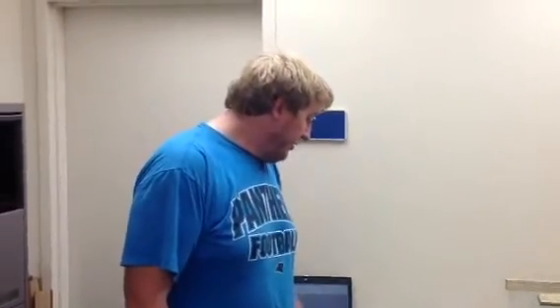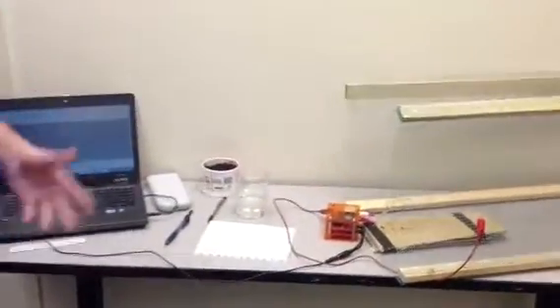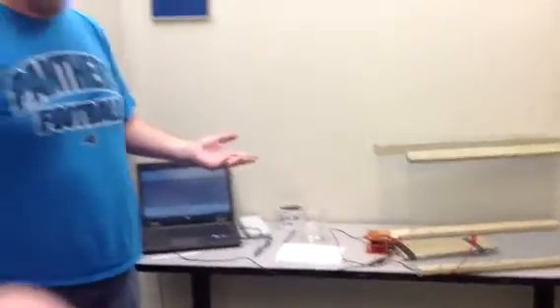And to start out with, I've got three different solutions. There's two right here on the table, and there's one right here, which is not labeled yet. Doesn't matter. There's 5% and 2.5% alcohol right there. And this one right here is 10% alcohol, which is the standard concentration for anesthetizing worms and other invertebrates.